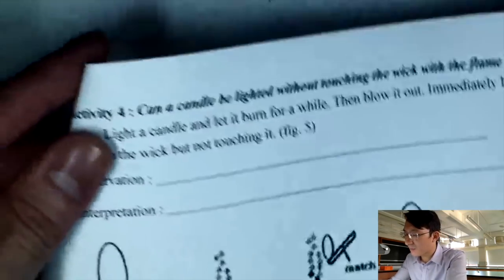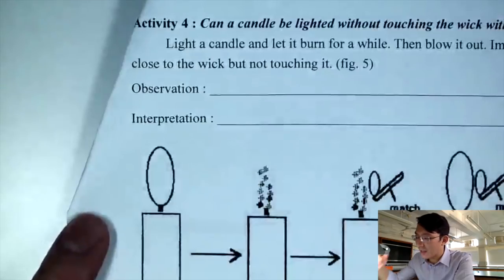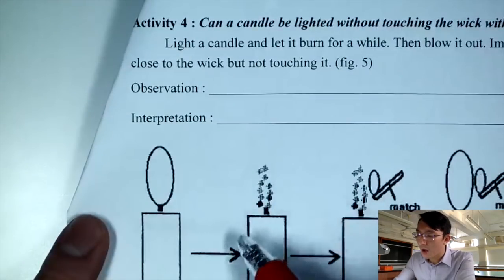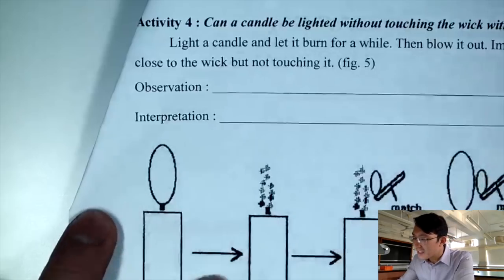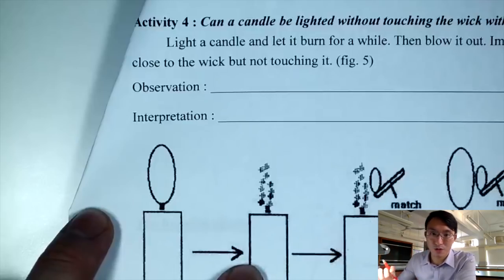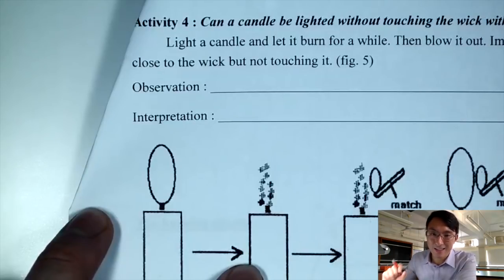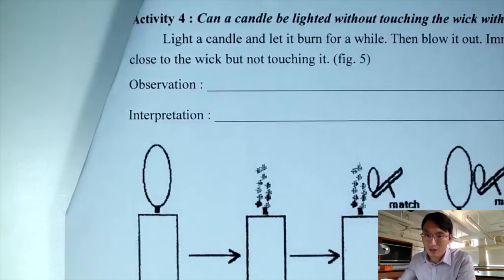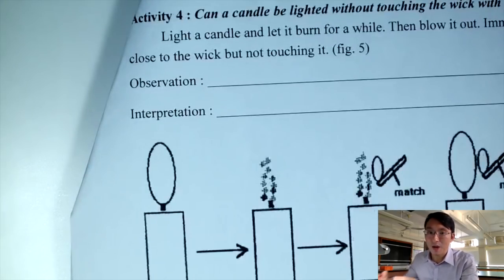The last one is very magical. We first light up a candle and prepare a burning splint — we don't use a match, we use a burning splint. Then we blow out the flame and immediately place the burning splint close to the wick, but never touching the wick. We want to find out if it is possible to relight the candle without the flame actually touching the wick. I will now move the camera to the setup for the demonstration.